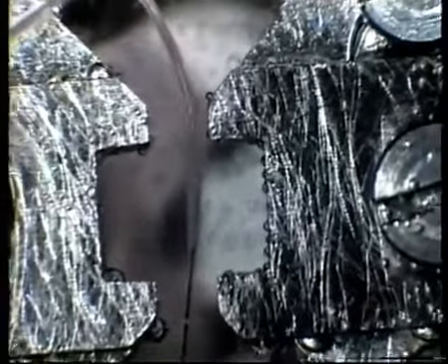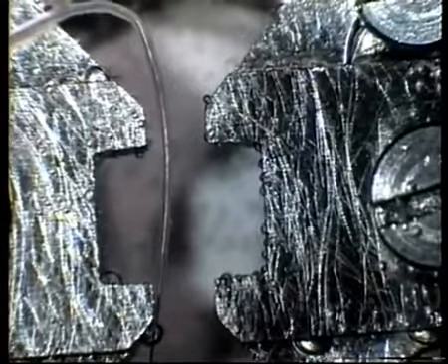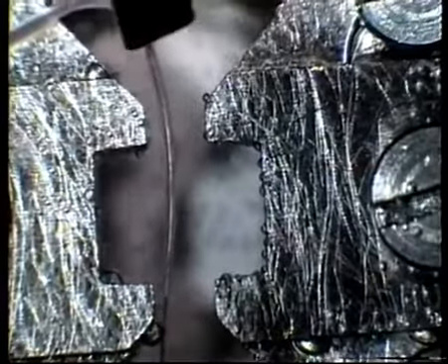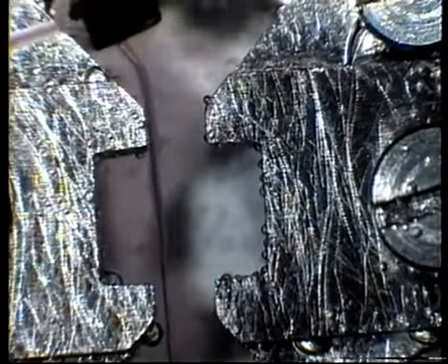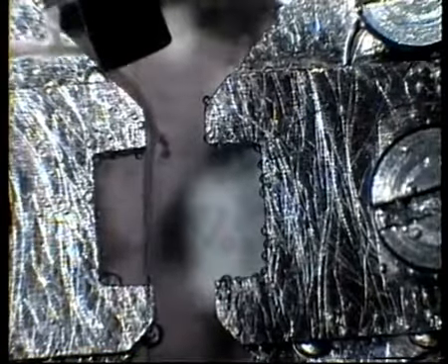The vessel is adjusted to bring the distal part into the gap between the mounting heads. With the screwdriver pressed against the wire, the vessel is held back and positioned in the gap. The artery should be able to move freely in the longitudinal direction, and therefore it should not be clamped between the lower parts of the supports.